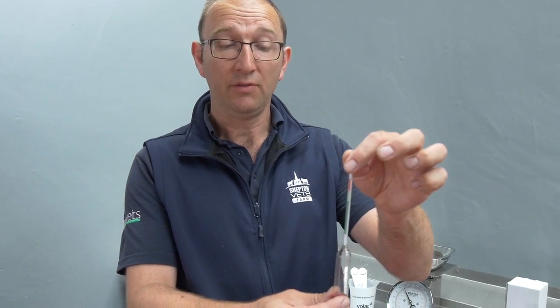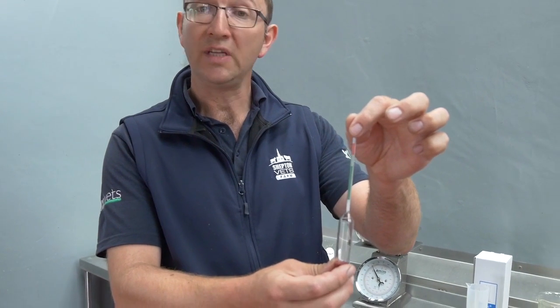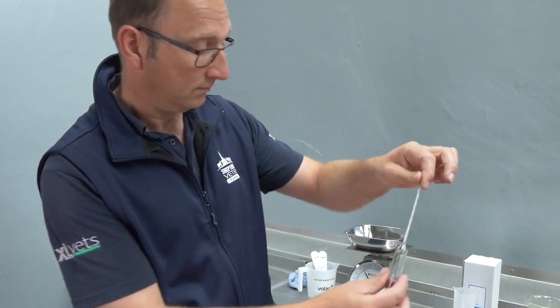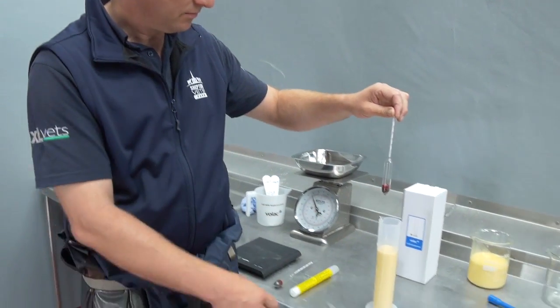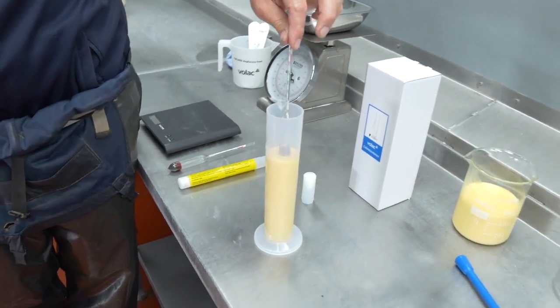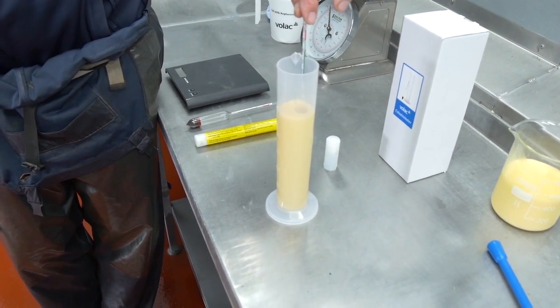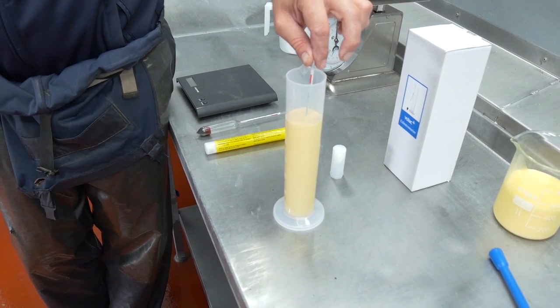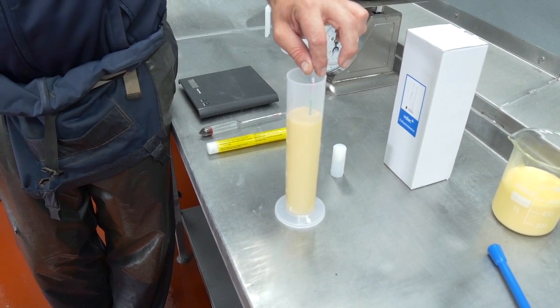I'm going to demonstrate that to you from some colostrum that we obtained from a farm just a few minutes ago. So practically, fill up the receptacle to its level and very carefully drop the colostrometer into the colostrum and see how far it goes down.